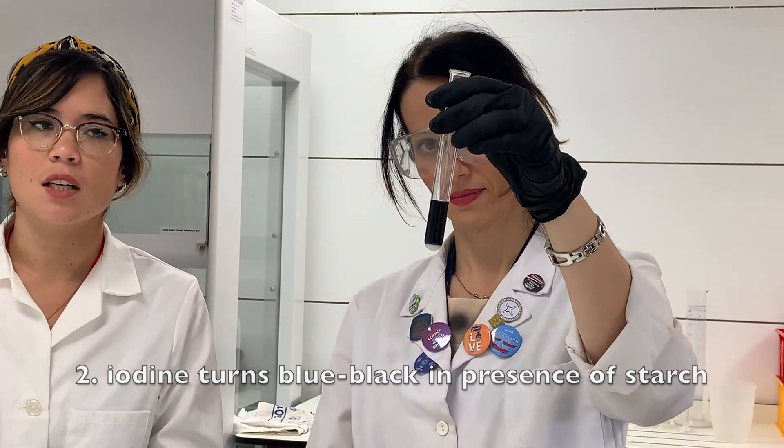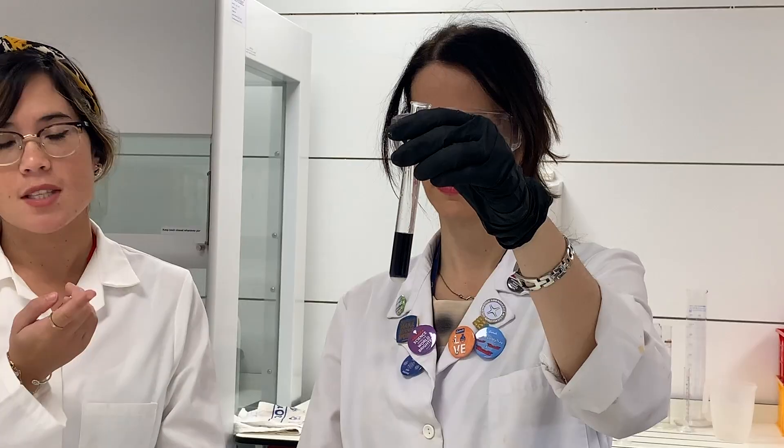Remember, things like potatoes have plenty of starch, so if you were to place a few drops of iodine onto a potato, you'd see the same blue-black color. To summarize: to test for starch, add iodine solution. A blue-black color indicates a positive test for starch. If it had remained brown, then we would say that no starch was present.